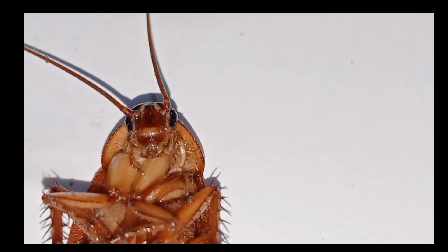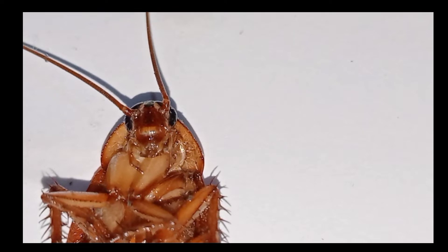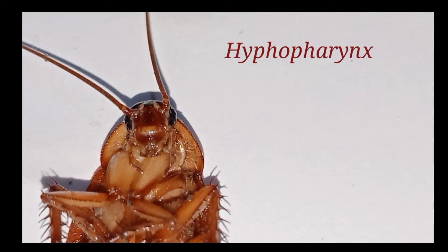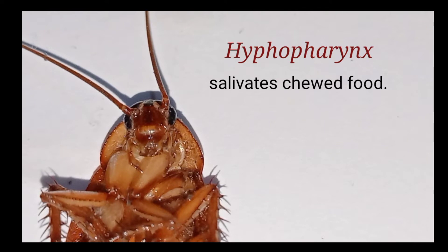And the upper lip, labrum, and the lower lip, labium. The hypopharynx is also present to salivate the chewed food.